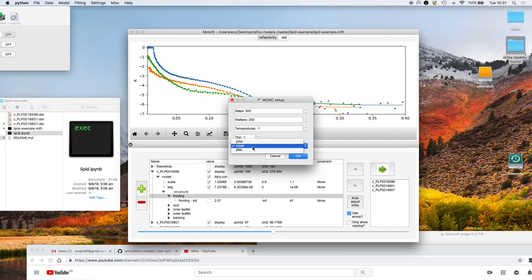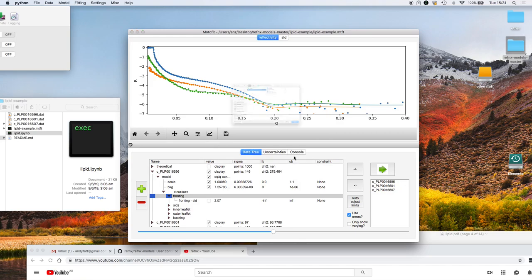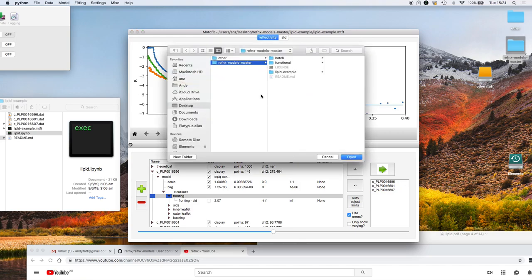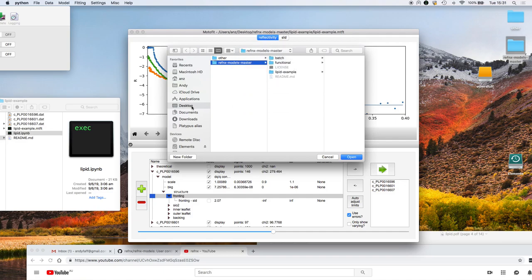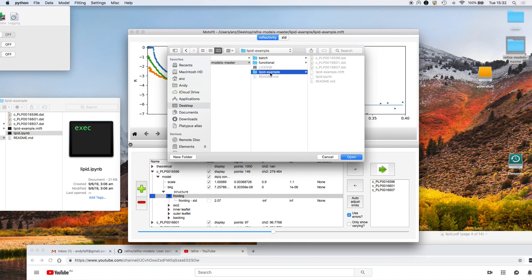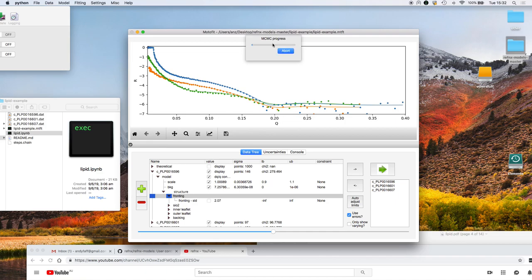The covariance of those walkers would be the same as the covariance for the parameters. Or you could use jitter where each of the parameters is perturbed by a small amount. But covar is what we're going to use. When I click on go we come up with a dialog to say where do you want to save output from the sampling process. I'm going to save it in that directory there, click on open, and once you start going it comes up with the dialog saying MCMC process.